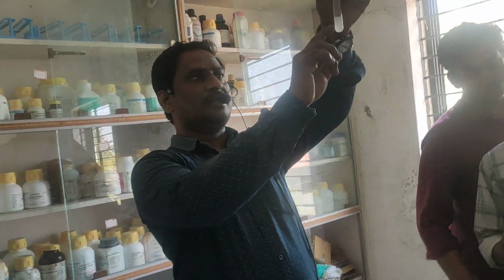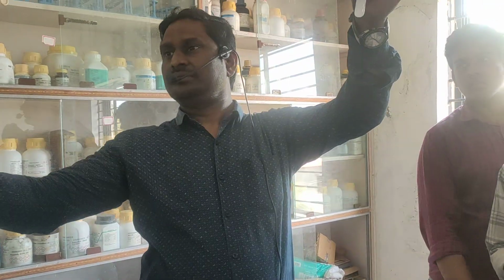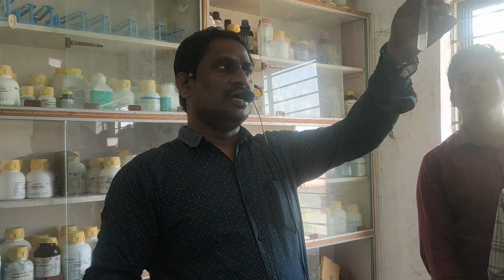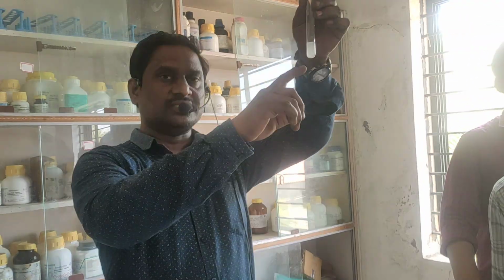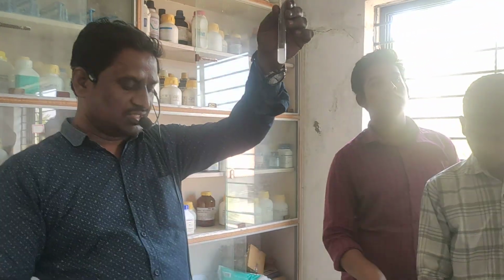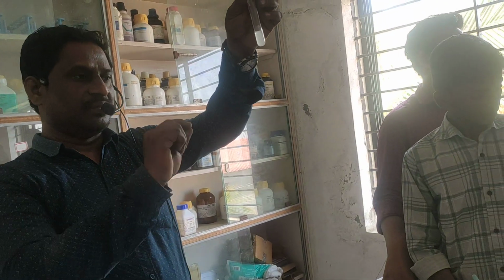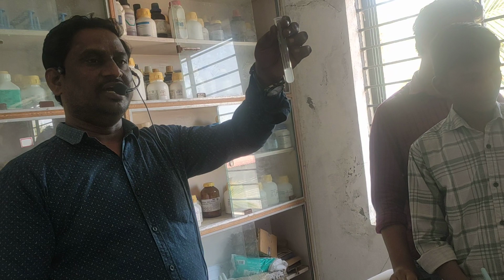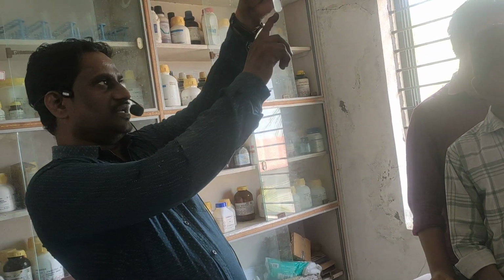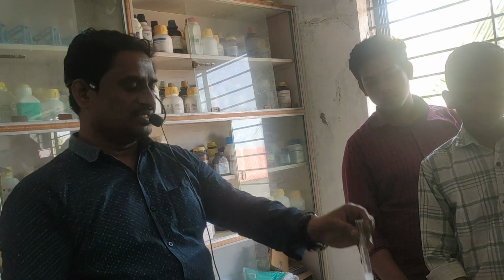Analysis of fifth group. Original solution plus ammonium oxalate solution. We get a white precipitate. Ca plus 2 is present. You can observe here, the precipitate is settled down. So Ca plus 2 is confirmed.